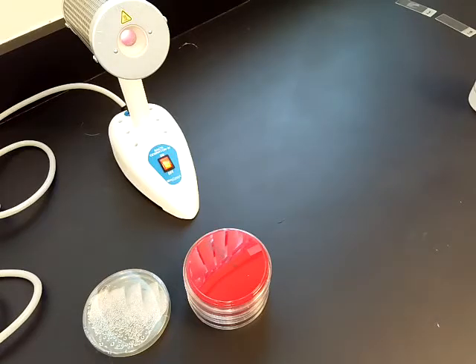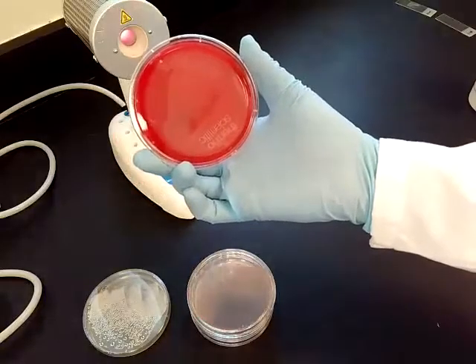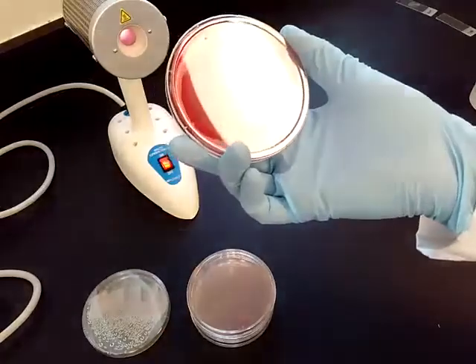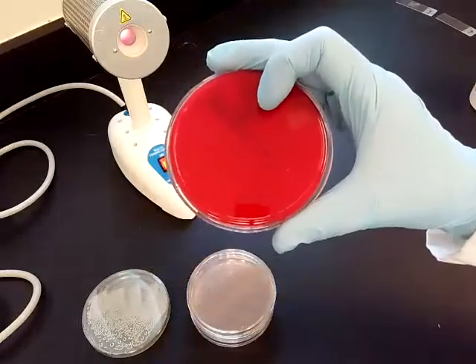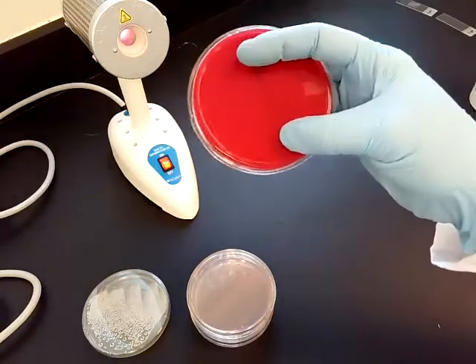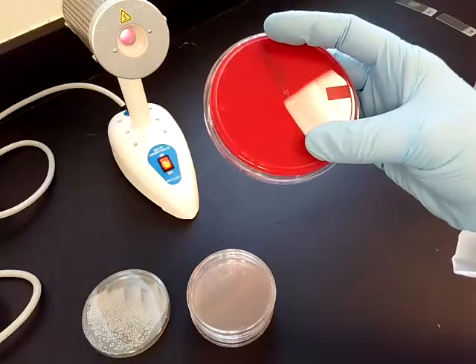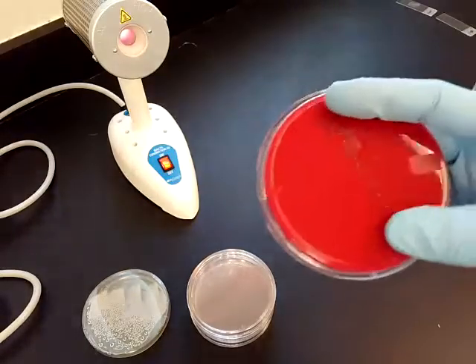So I'm going to go through just 4 types of media that are pretty commonly used in a clinical setting, starting with this one. This one is blood agar. Blood agar contains sheep blood, and that's the most common type of blood agar you have. Sometimes different substances can be added to the blood agar, but this is just simple sheep blood agar. Blood agar is useful because it allows us to distinguish microorganisms based on their ability to eat the blood cells, and that's known as hemolysis. Lysis means to break apart. Hemo is talking about the blood, so the ability to break apart the blood.